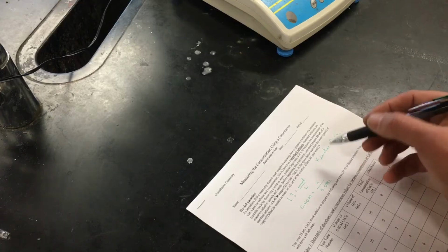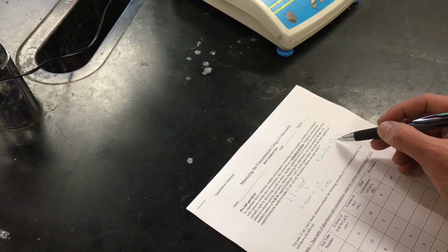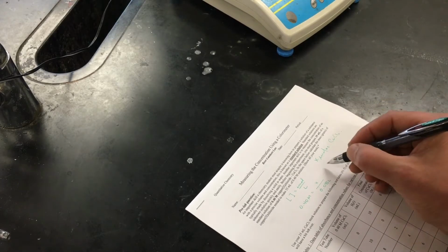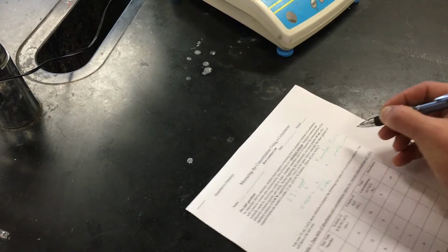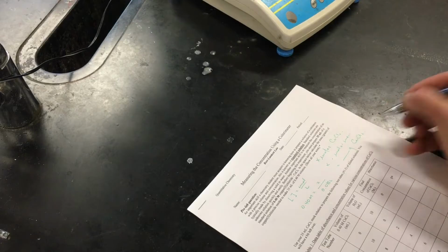So we're going to get the number of moles that we calculated here, multiply by the molar mass of copper chloride, and that will give us the number of grams of copper chloride that we need to prepare the solution.